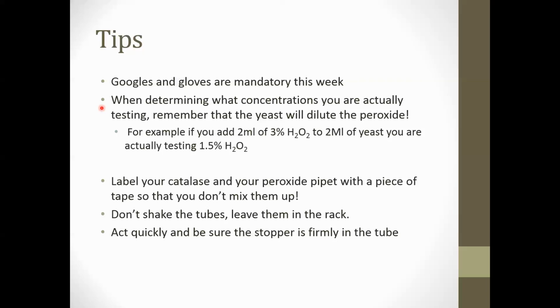And one thing I want to point out, we're pipetting yeast. Yeast contain catalase. Yeast is not catalase. Yeast is an organism that contains the enzyme catalase. Many times students mix that up and think somehow that yeast is catalase. And yeast is an organism just like you, only in this case it's a single-celled organism, but it has organelles just like you. And in the peroxisomes we have catalase, which will break down hydrogen peroxide into oxygen gas and water.